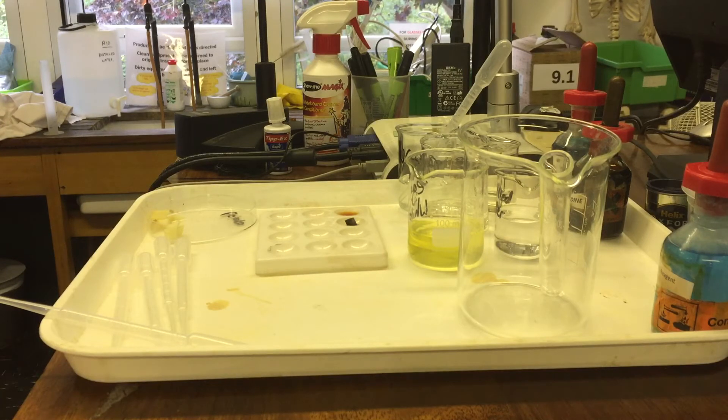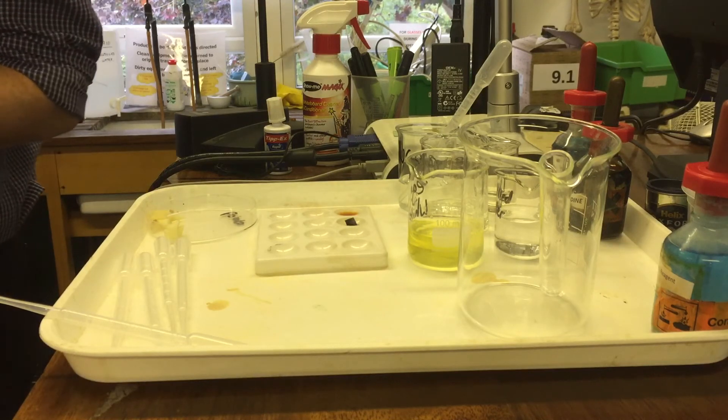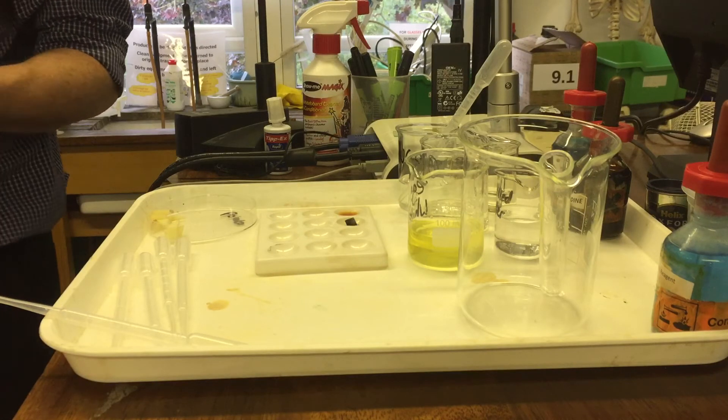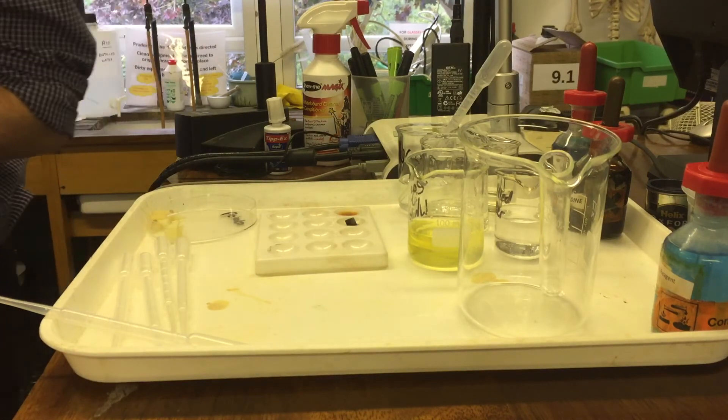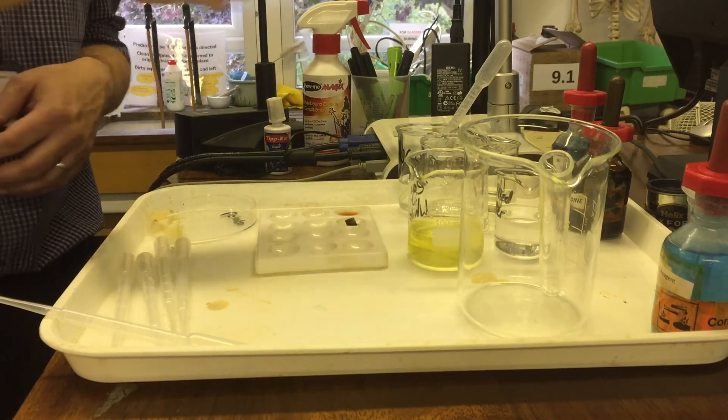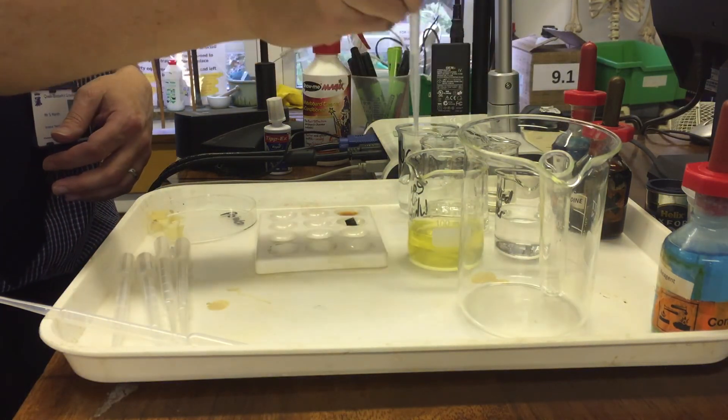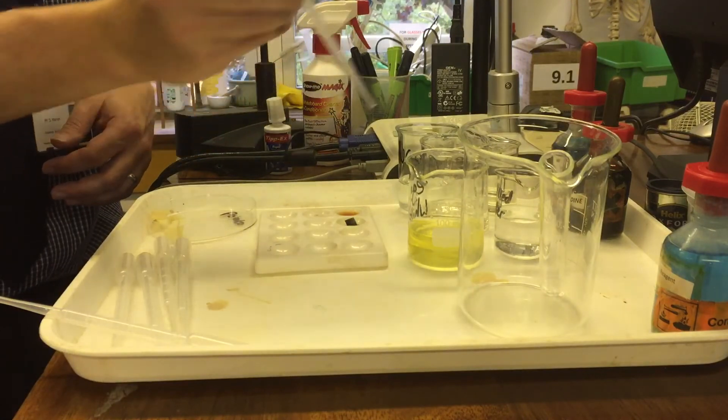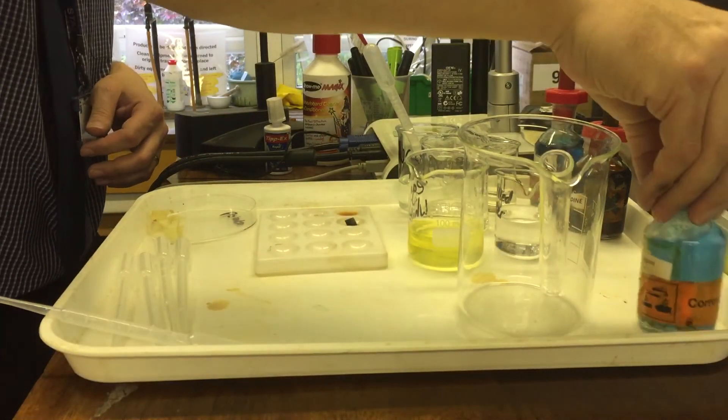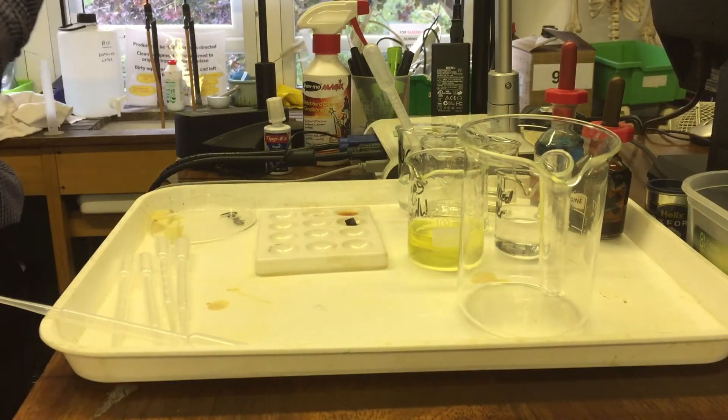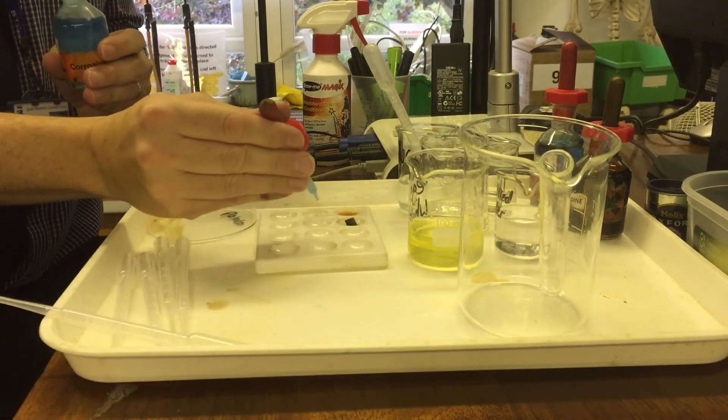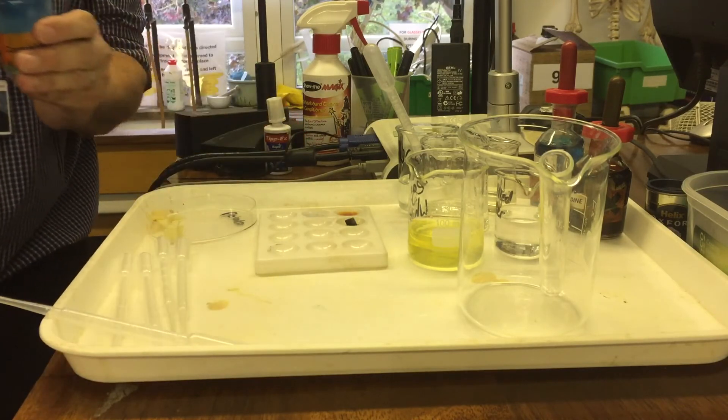Our next test is a test for protein. We're going to use something called biuret reagent. And again, just for comparison, I'm going to compare it with glucose. Here's glucose solution. So this should be our negative test. And if I add this reagent here, which is biuret, which is this lovely light blue, if I add it to this, it stays that light blue color. It doesn't change.